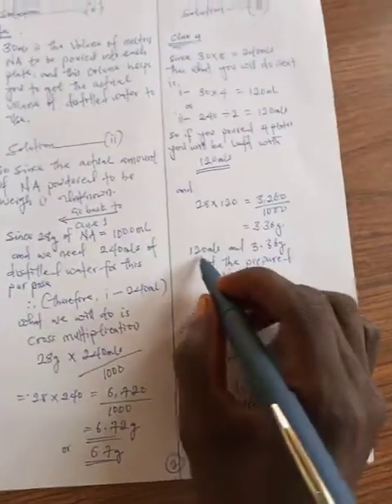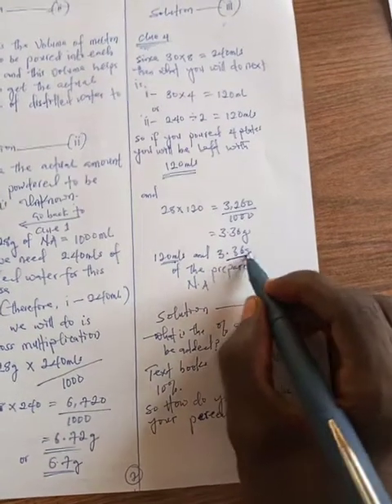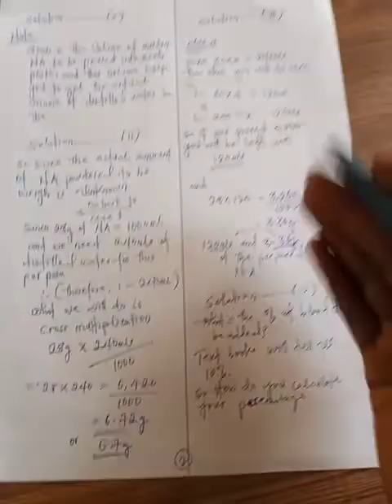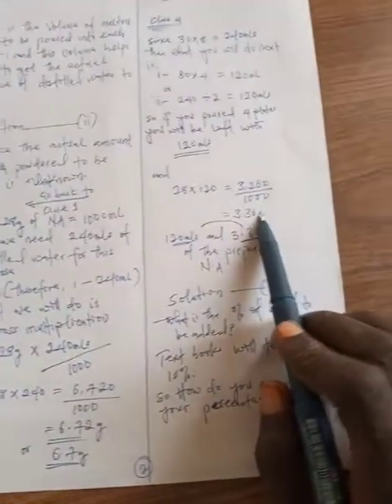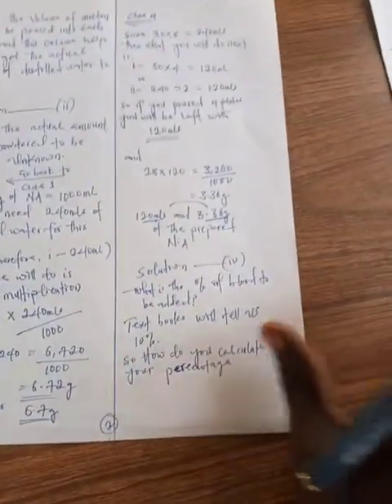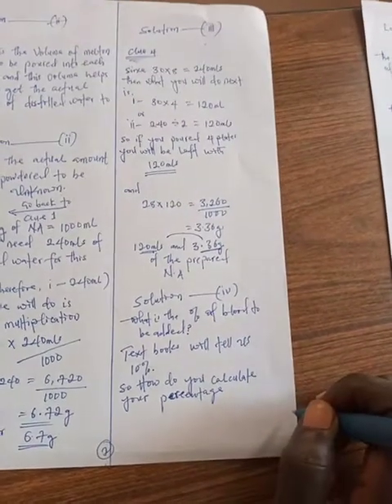So 120 mils and 3.36 grams of the powder will be left that was being prepared. So what next are you supposed to do? Now we have answered question number 3. When you prepare 4 plates, you will be left with 120 mils of distilled water and 3.36 grams of nutrient agar powder, molten powder left that will be used to prepare the other 4 plates for blood agar.